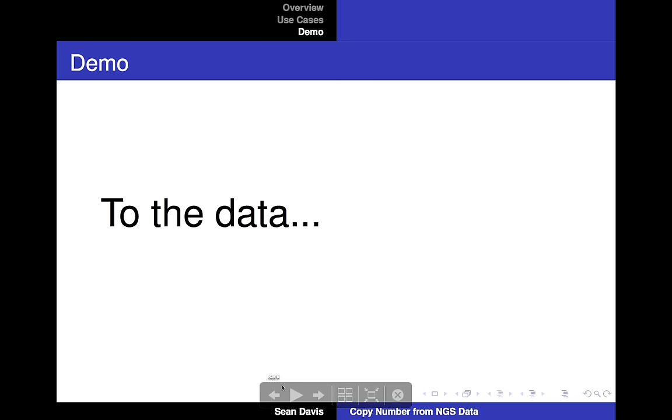And the choice of controls will be important. There's another piece that goes along with this. In some contexts, there may be better ways at getting copy number. Let's say more precise ways of getting copy number than using strictly read count based methods.